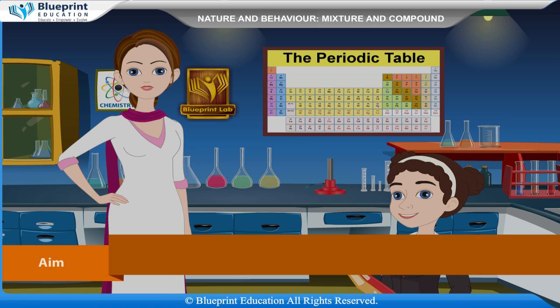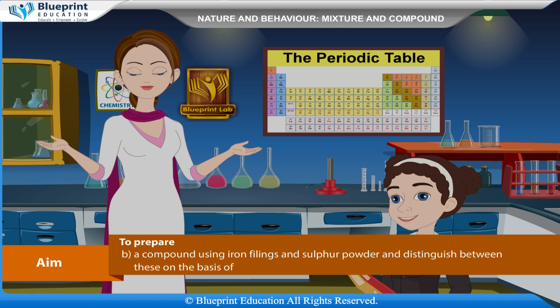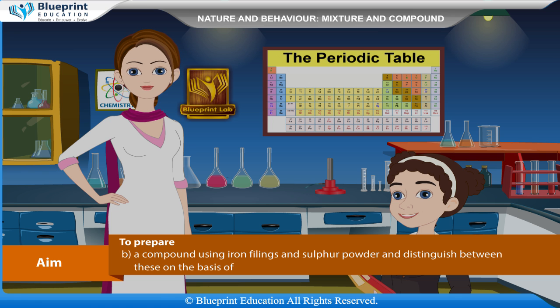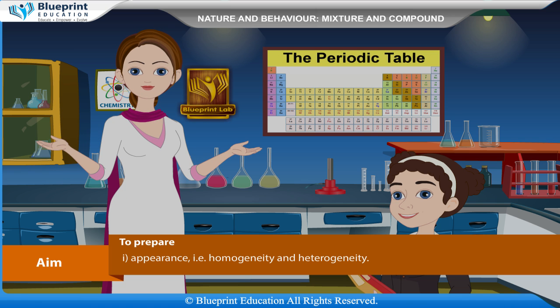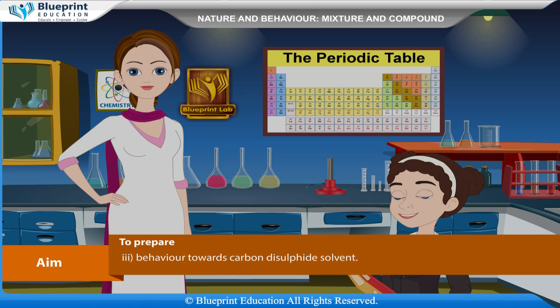Our aim is to prepare a mixture and a compound using iron fillings and sulfur powder and distinguish between these on the basis of appearance, i.e. homogeneity and heterogeneity, behavior towards a magnet, behavior towards carbon disulfide solvent, and effect of heat.